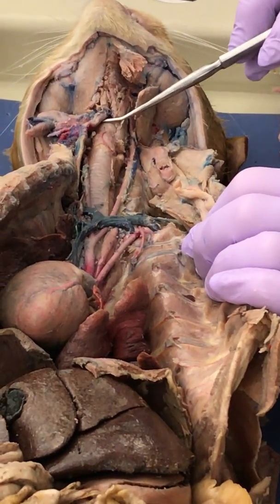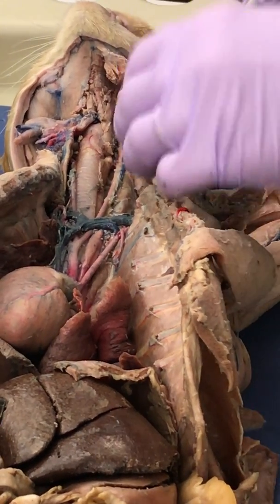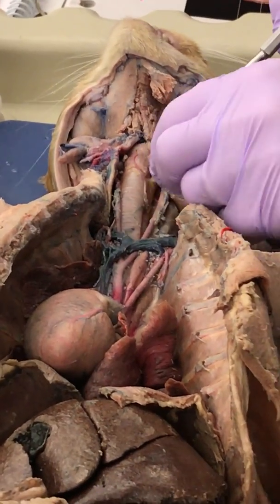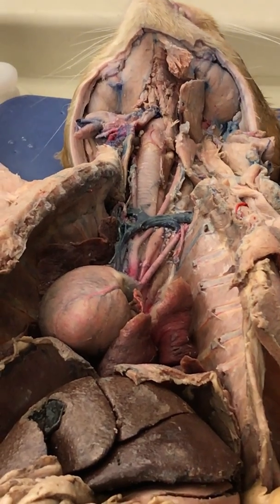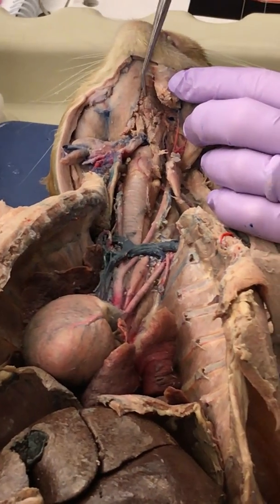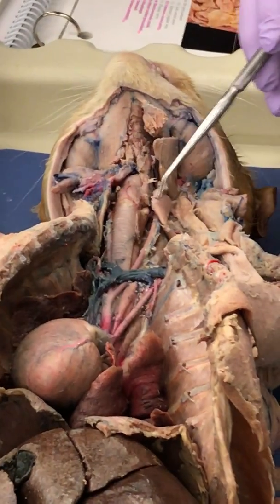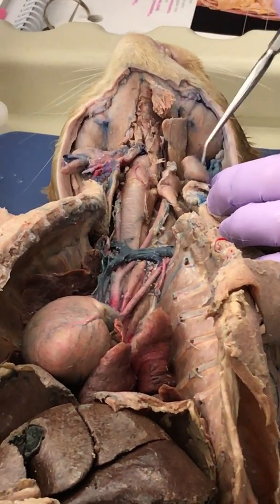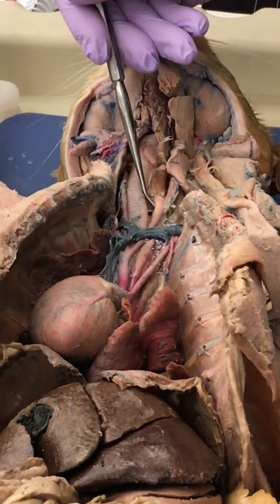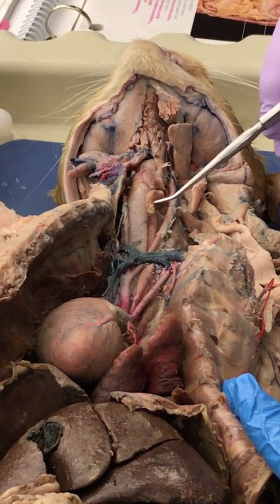Okay, so trachea, larynx. We already mentioned parotid gland. And what did you guys do with your submandibular? Here it is. Submandibular gland. Now, I was telling you in lecture the other day, to find sublingual, we'd have to take all this musculature out. So I don't want to do that. So we did find the submandibular and the parotid, and those are two salivary glands. Oh, another nice view of the esophagus here. And we already mentioned the thyroid gland. It's a good view of that.